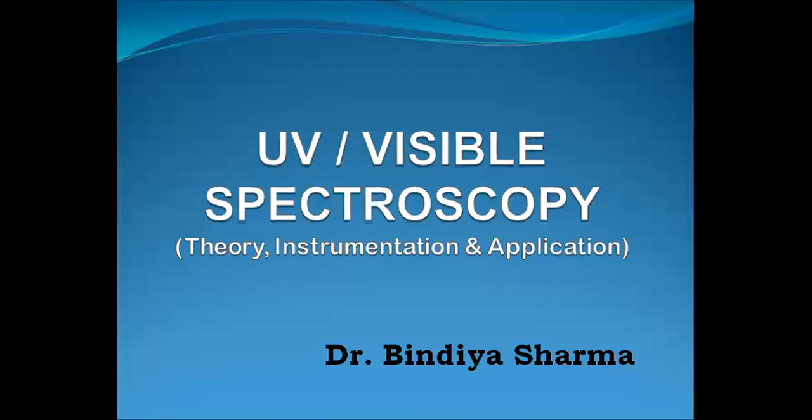In the previous lecture, we have learnt about the derivation of Beer-Lambert law. In this lecture, we'll study the introduction and theory of UV visible spectroscopy. I would suggest that if you have not seen the lecture on Beer-Lambert law, please first view that lecture.